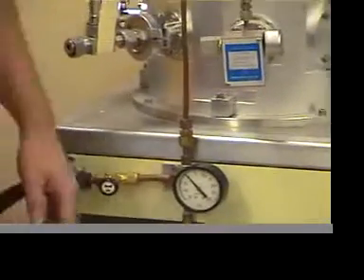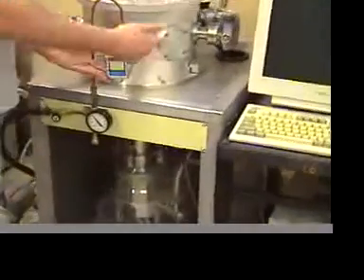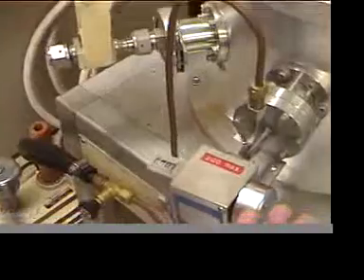This little gauge right here tells you what the pressure is inside the gas handling system relative to atmospheric pressure. Once you've done that, you can come over here and use the variable leak valve to basically let gas in and block it off from going into the vacuum chamber.